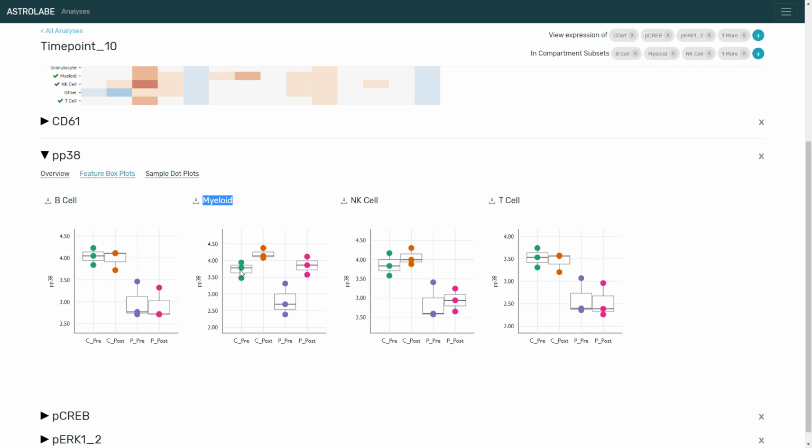And by the way, all this is quantified in the reports export. This is a much more significant increase. It's closer to a 2-fold increase.